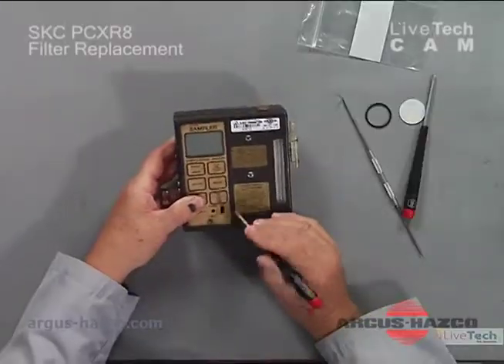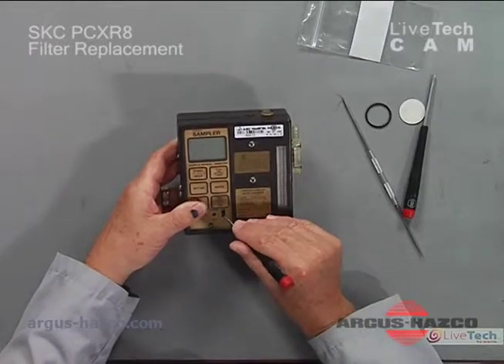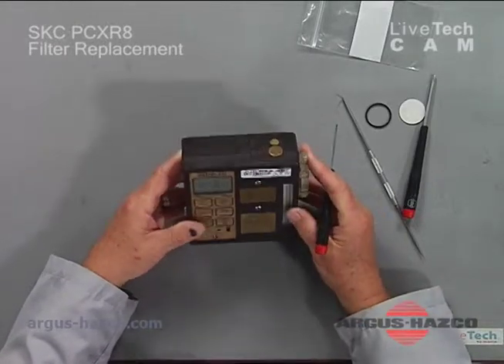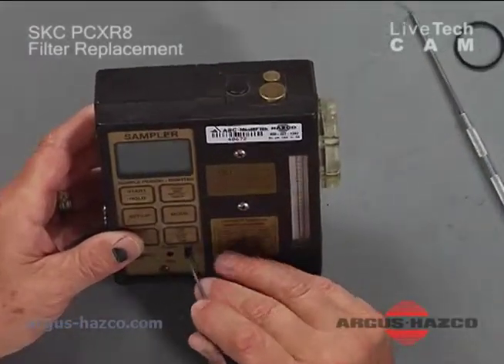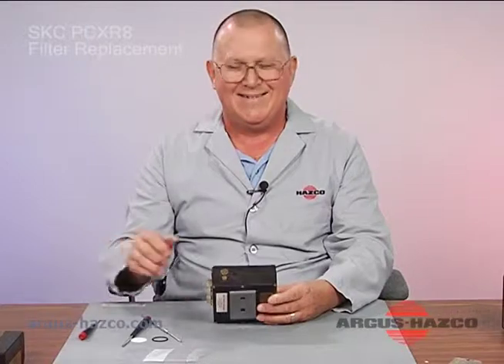At this point you can turn on the unit, although this procedure shouldn't affect any of the operation. You are now ready to use the pump. This completes the installation of the filter.